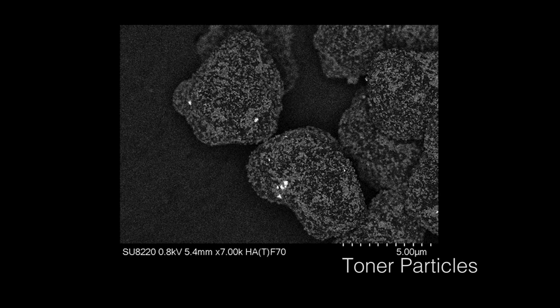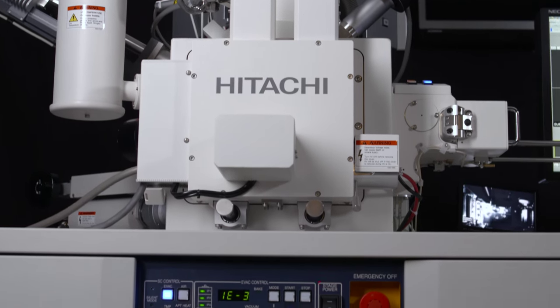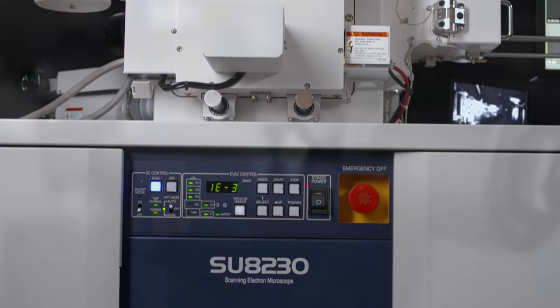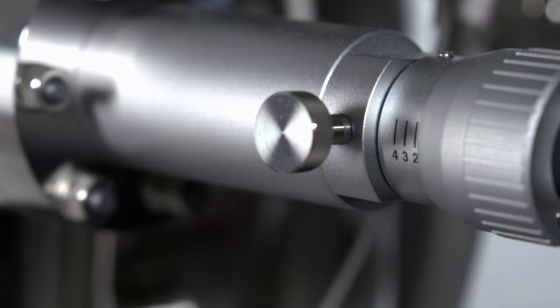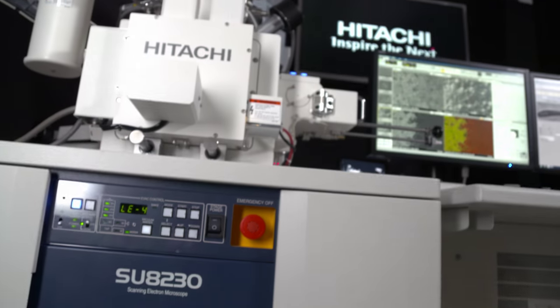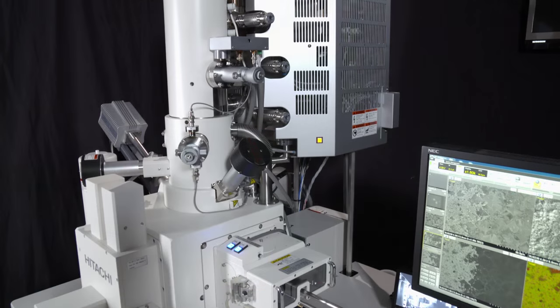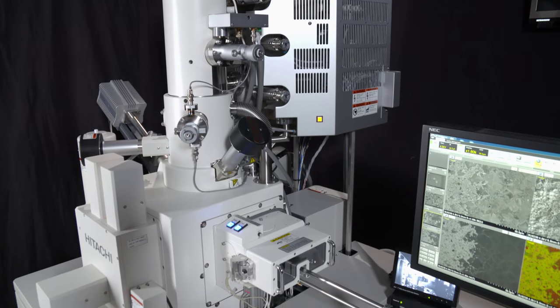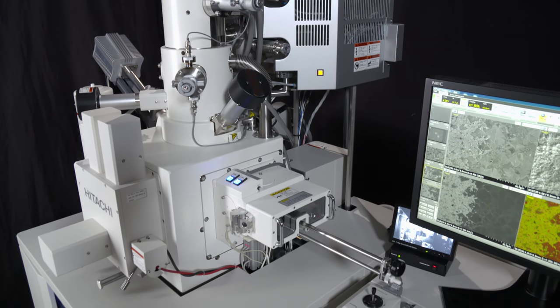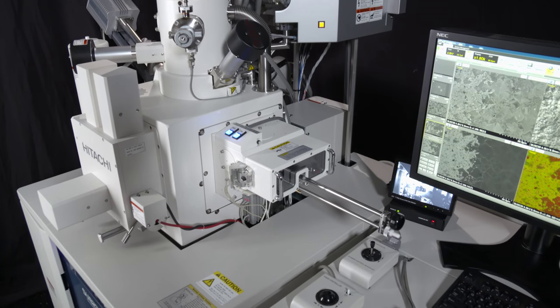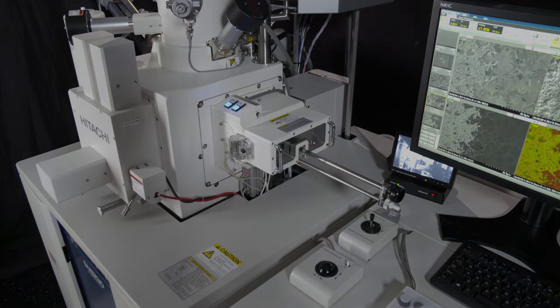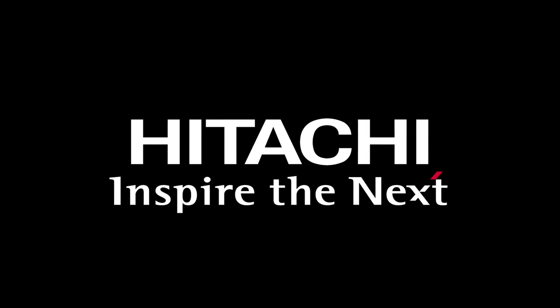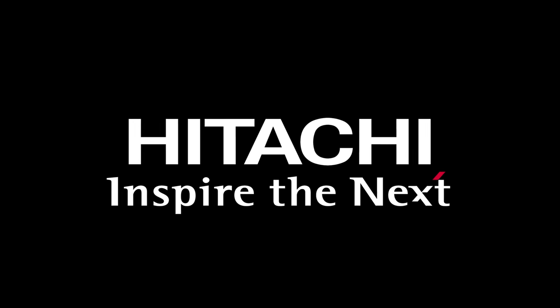Continuing in this tradition of providing robust, reliable, and innovative instrumentation with the lowest cost of ownership, Hitachi's SU8200 series delivers the ultimate FE SEM with unmatched brightness and beam stability, affording ultra-high resolution imaging and high-quality elemental analysis at low voltages, with a variety of configurations to meet your requirements. Hitachi. Inspire innovative discovery in your lab.